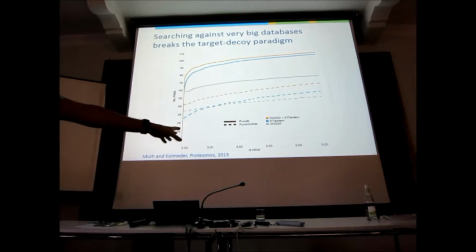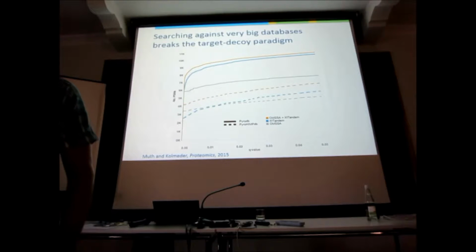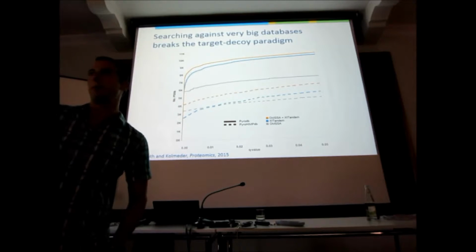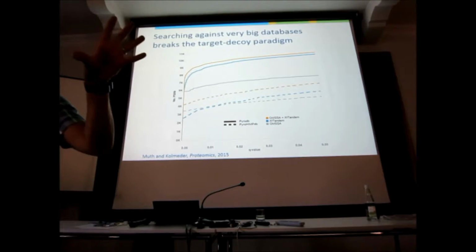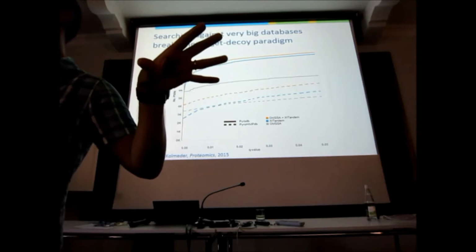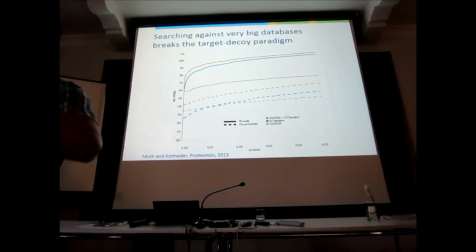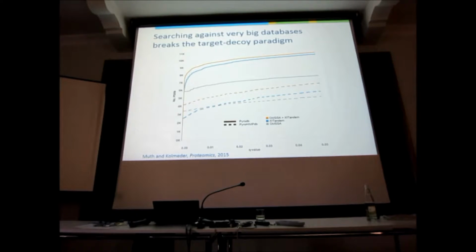Now, the big database, metaproteomics. We have OMSSA in gray, Tandem in blue, and the combination of the two search engines in orange. Combinations of search engines give you more hits. That's why our tools in the tutorials, SearchGUI and PeptideShaker, are useful. SearchGUI ships with 7 free search engines built in. You download the file, unzip it, and you have just installed 7 search engines on your computer. You run it, give the result to PeptideShaker, it piles it all together, and gives you this orange line, which is always better. It's usually not huge, 5 to 7 to 10% in the best cases, but it helps.